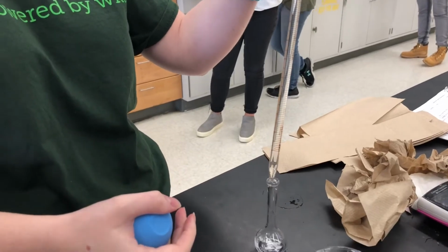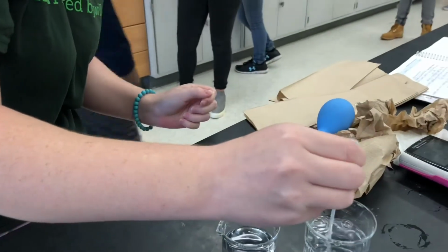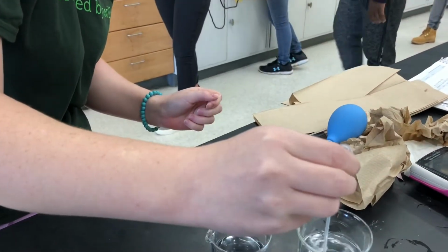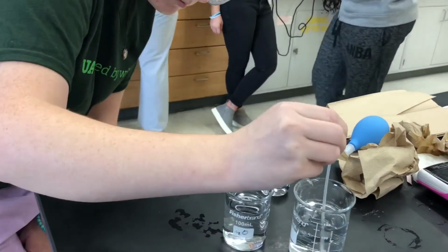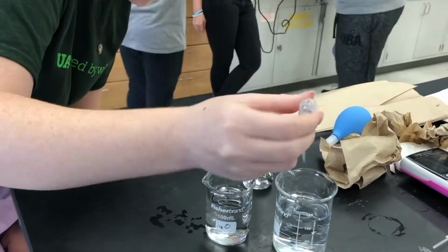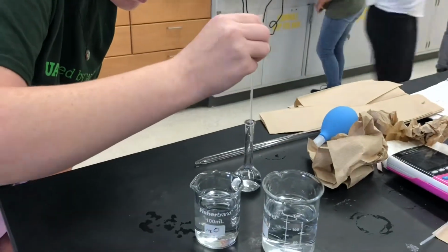Dilution is the process of reducing the concentration of the stock solution by adding additional solvent, in this case water, to the stock solution. The concentration of the final dilute solution is found by using the equation of initial or stock concentration times the stock volume, set equal to the final or dilute concentration, in this case X, multiplied by the final volume, in this case 25 milliliters.